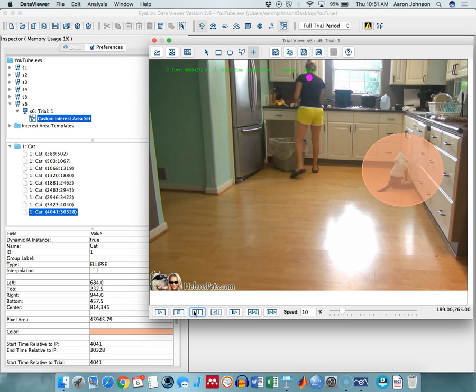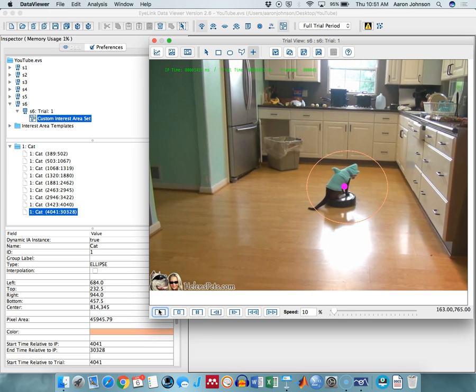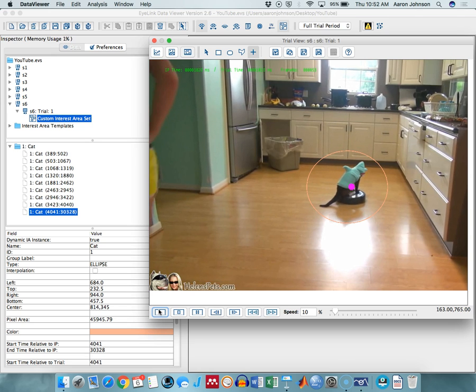Okay. Now, what Karen was saying is quite true, in terms of, is there an ideal number of frames that you should move? The answer is no. And that's because if I play this back, so if I go back now to the beginning, I'm going to play the video back now, and I'm not going to touch it at all. What you'll see is that the areas shift now with the video.